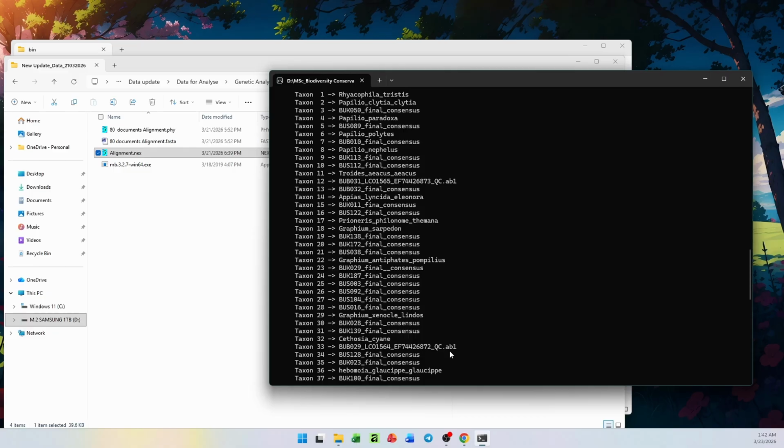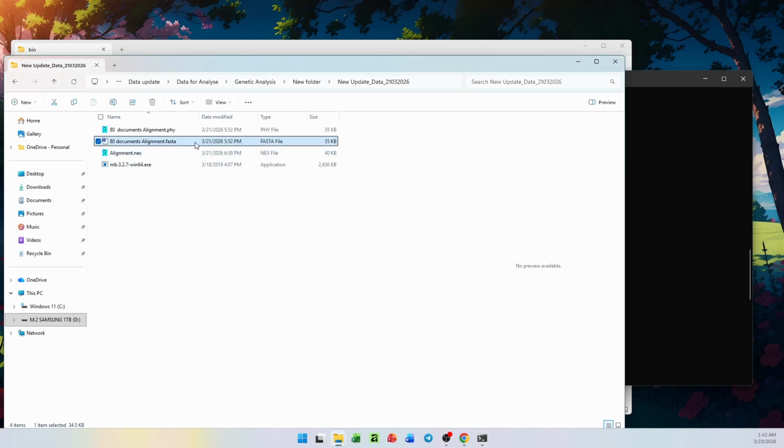I don't use it, but they are actually free software to edit the raw sequence, check quality, cut out the primer regions, do pairwise alignments, BLAST, find out the spacing, and then do multiple alignment to get this file. Getting this file spends a lot of time to complete.